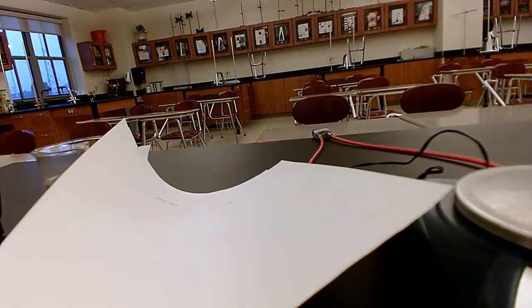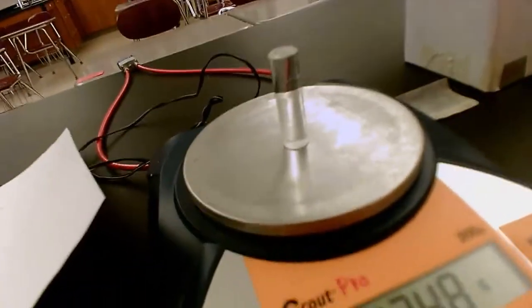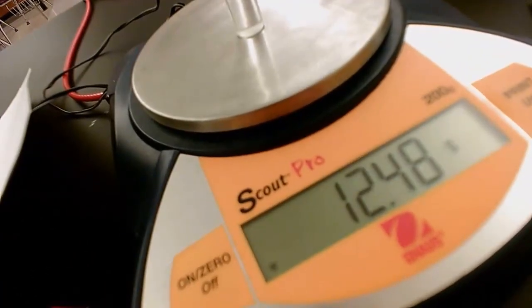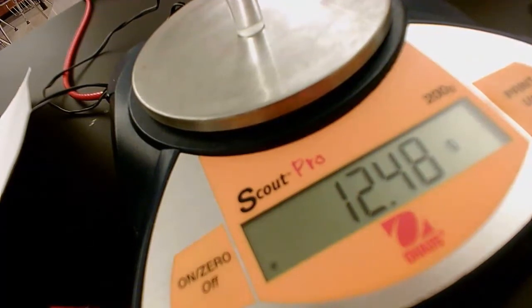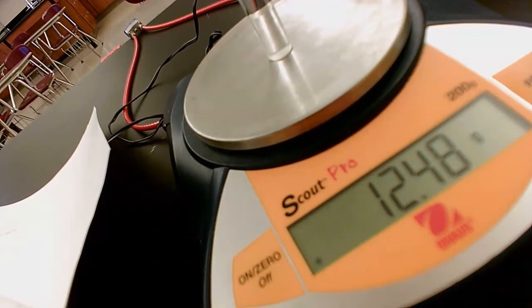So now, for part C, those people that will have solid C. Here's what solid C looks like. Sort of clear, so you know it's not a metal. And that is the mass of C. Same size, a lot lighter. Make sure you record it to 2 decimal places.